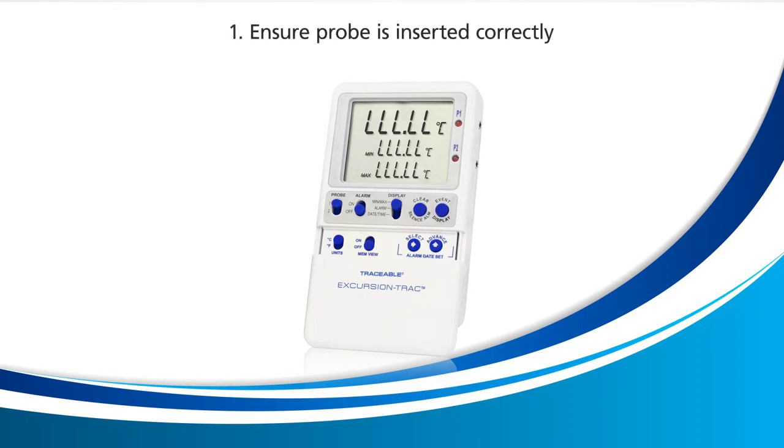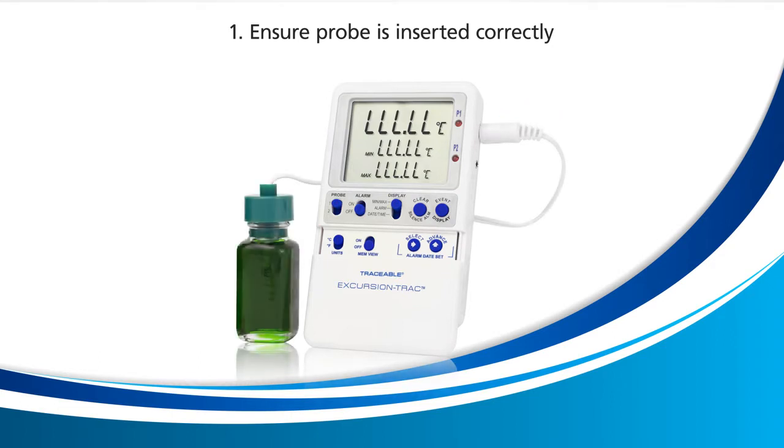The first remedy is to ensure that the probe is inserted correctly inside the probe jack located on the right. Ensure that the probe is fully inserted as shown here.